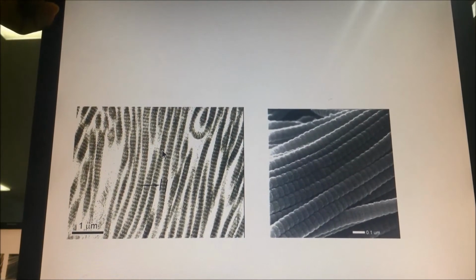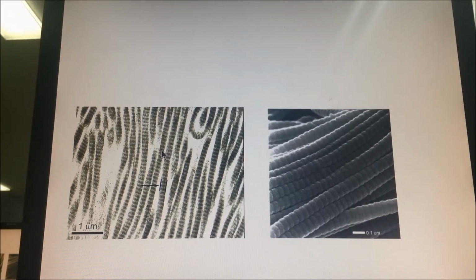This is because collagen is a birefringent structure. It can change the direction of the polarized light. فبتبين الفايبرز with this characteristic striated appearance. The same thing over here, but this is a scanning electron microscope. بعطينا pseudo 3D structure. وبرضه أنا عندي هي هون striated appearance تبع الكولاجين.